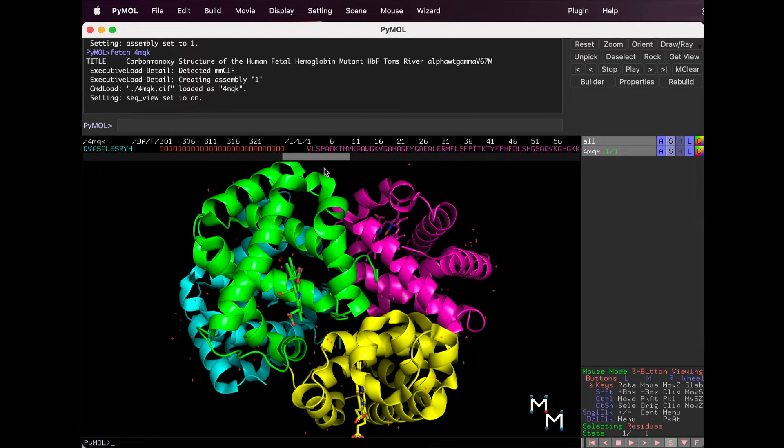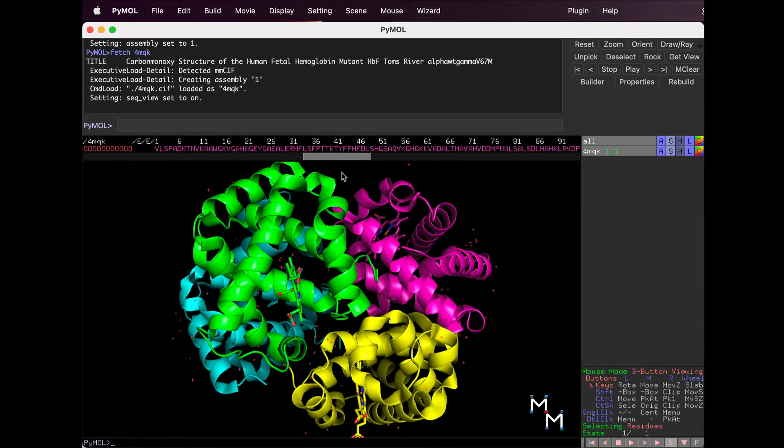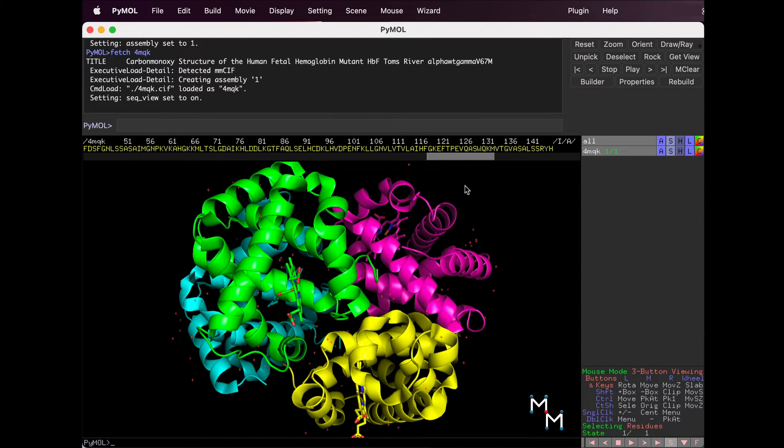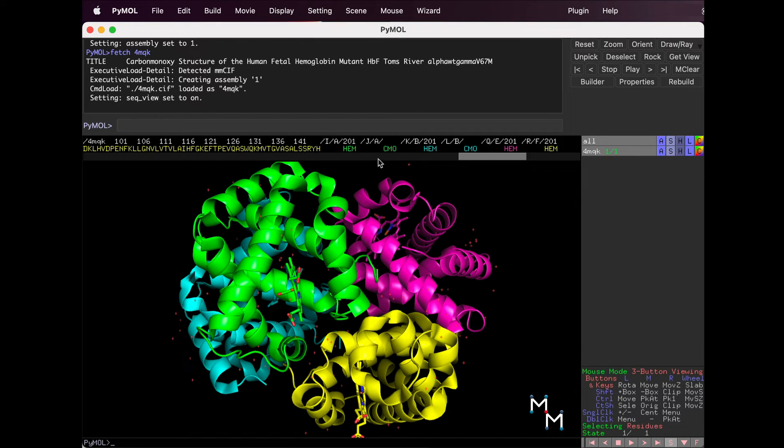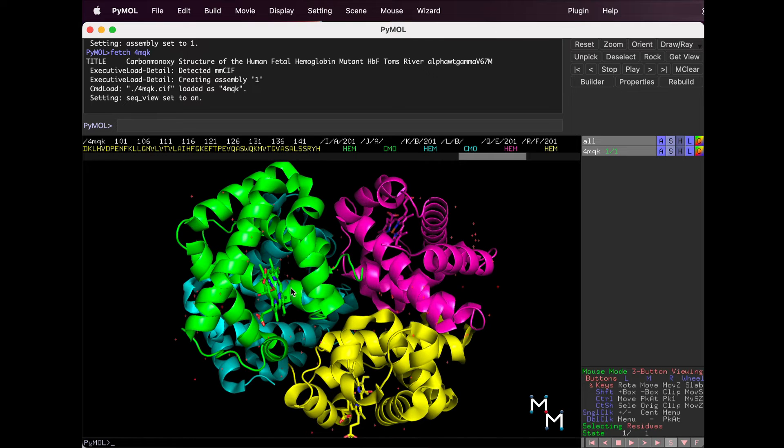If we scroll further, we'll see some unique three-letter codes. HEM is the heme molecule that shows up in a stick representation in the structure viewer below. HEM enables hemoglobin to bind oxygen.